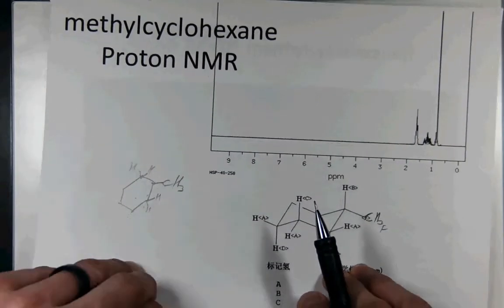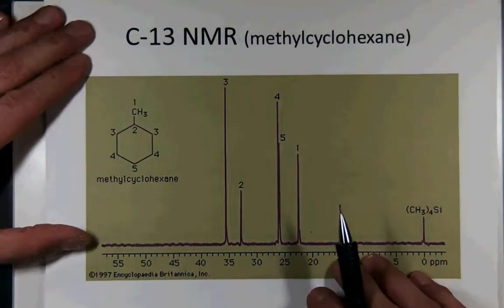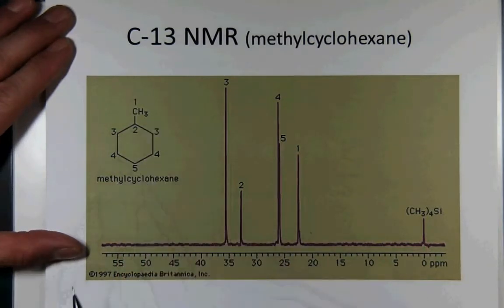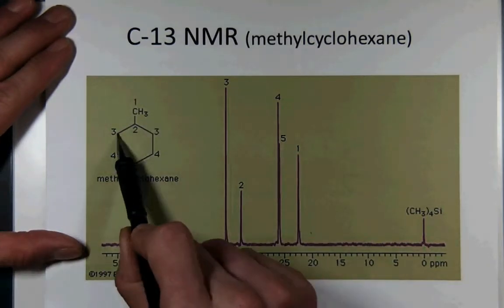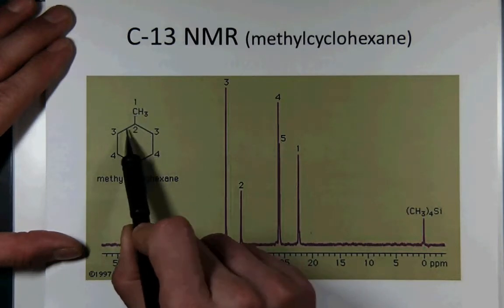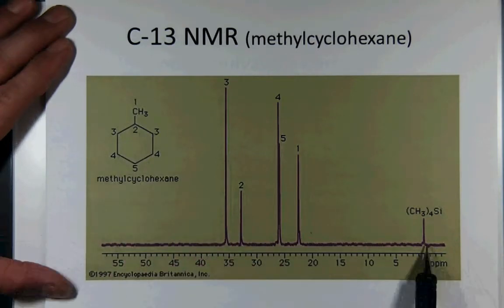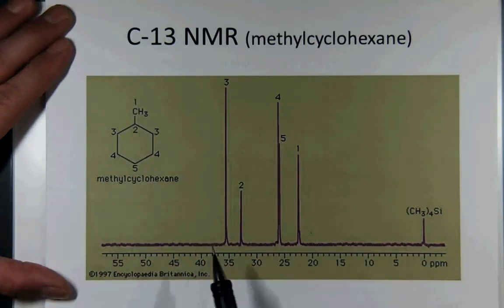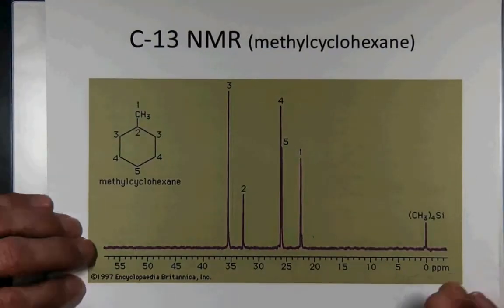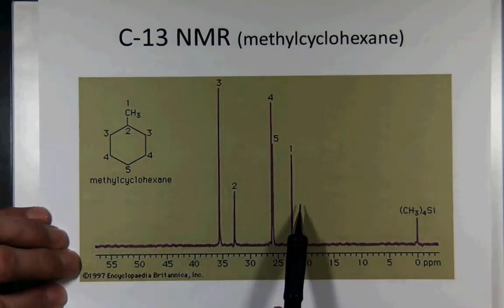But when you do carbon-13 NMR, that splitting disappears, and we're just looking at all the unique sets of carbons. So the methyl group's unique, the one on the ring that it's attached to is unique, the ortho position here is unique, meta and para. Again, you have a noisier background, but no splitting. And also you notice the peaks are of all varying heights.